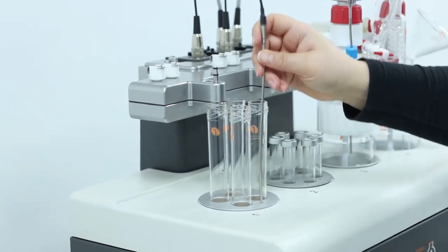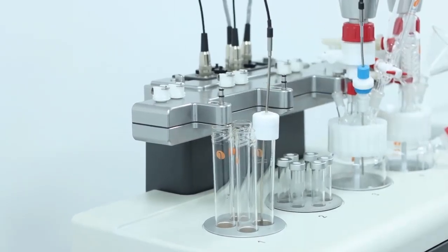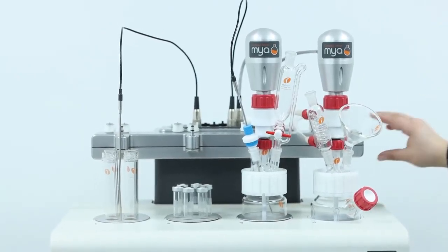Every multi-position insert has a temperature probe hole. You can choose to insert the probe into one of the tubes if you prefer. As you can see here, the vial inserts are used in the presence of a manifold head.